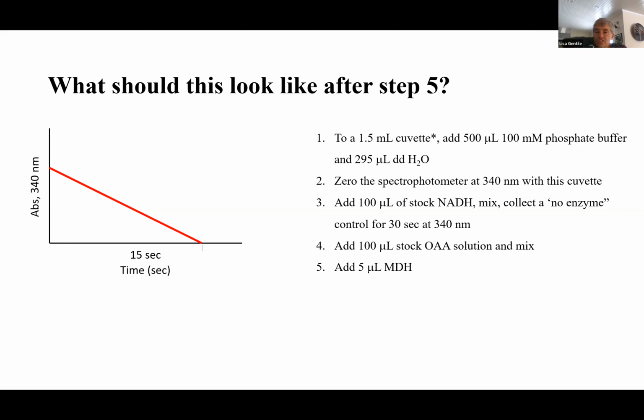Most of the time you have to dilute, even what I made, for the MDH specific activity assay. So I had so much left that I figured if I left it in the refrigerator for an extended period of time, it was going to die. So I just shoved it in the freezer in little Eppendorf tube aliquots. Anytime I need a control, I just pull one out. It's still perfectly fine.